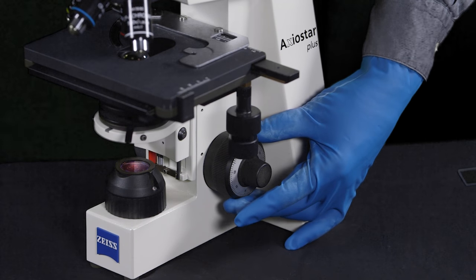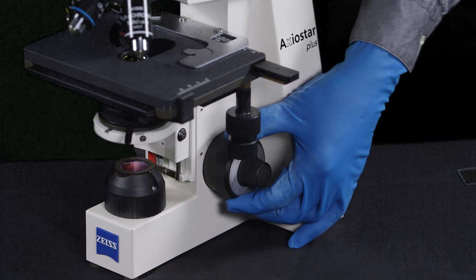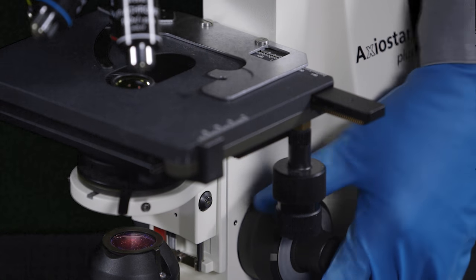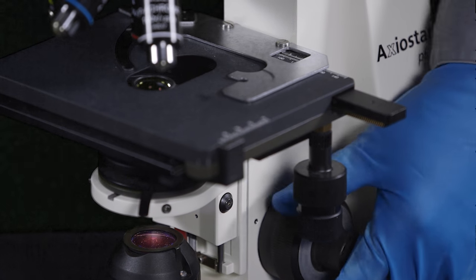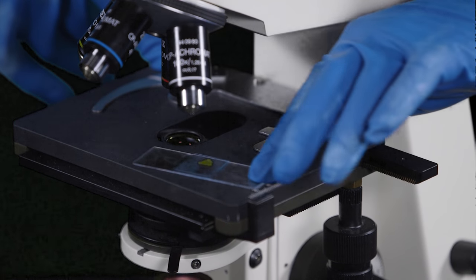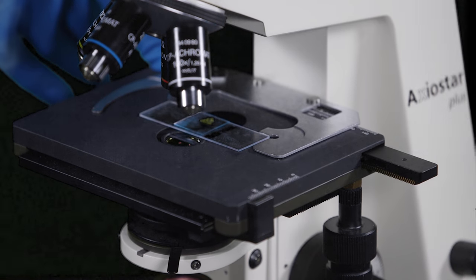The next step is to use the course focusing knob to lower the stage all the way to the bottom. Open the clip, put your slide on the stage, and release the arm.